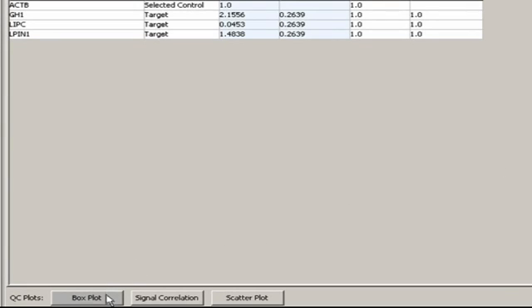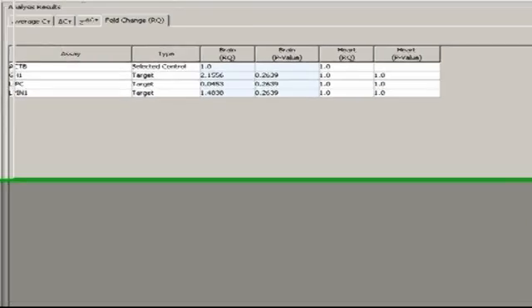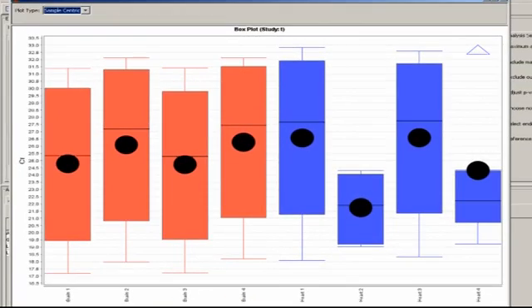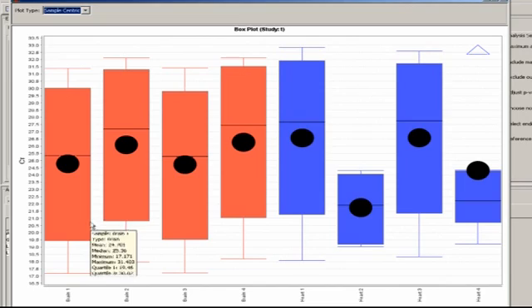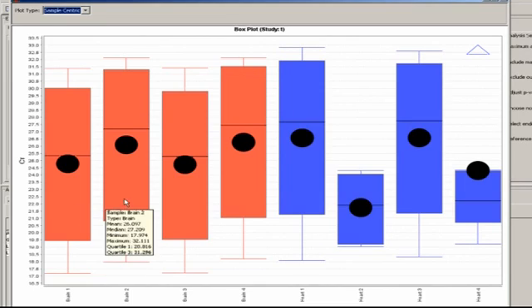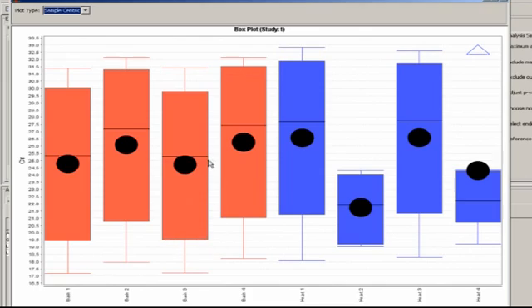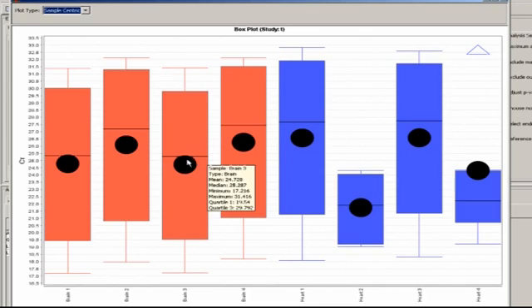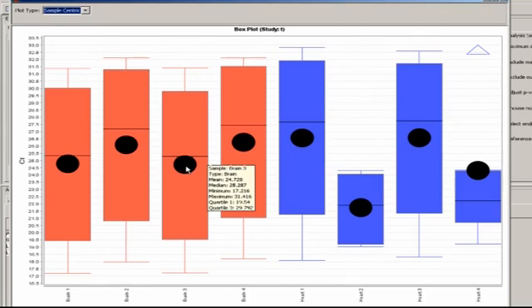The first QC graphic is the box plot, which maps out the range of CTs for each sample. The different colors represent our two groupings, while the boxes themselves cover the middle 50% of CT values. The black lines inside the boxes are the median CTs, while the circles are the mean CTs.